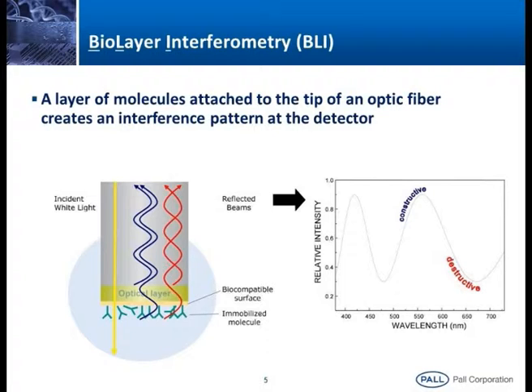When we say there is interference, suppose I put one stone into water; you see waves, right. If I put two stones simultaneously into water, what happens? Waves go that way, but on this side they mix together. That is what we call interference.